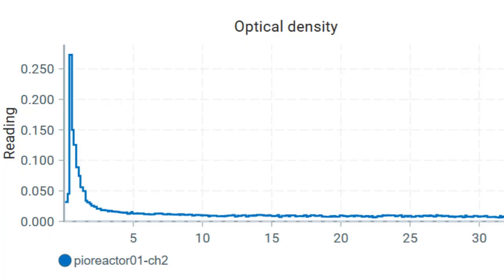Now, the way I tested this, I explained last week, was by adding 1 milliliter of modified clay suspension to 10 milliliters of algae, and putting all of that in the bioreactor, a machine that measures the optical density of the solution, essentially how much light it absorbs. And by doing that, I got curves that look like this.